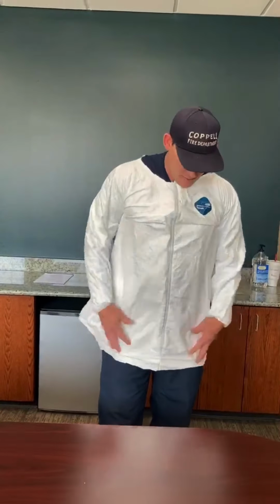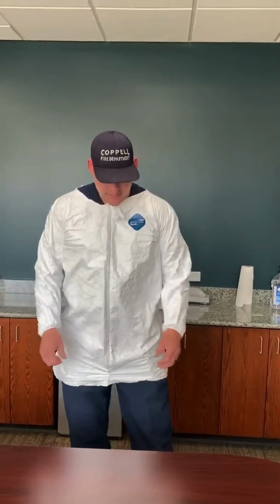And this is a large. We have large and extra large, so if you're a bigger guy, you need to make sure you get the extra large. And that's how it'll fit.